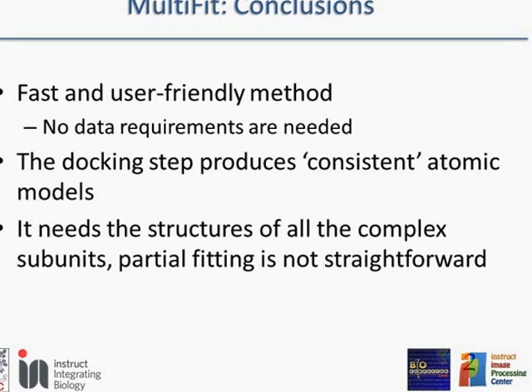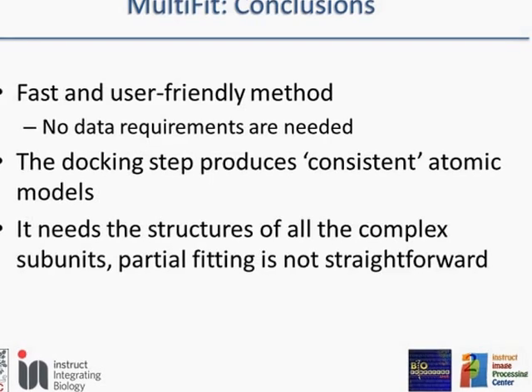Because it is using a docking step, MultiFit produces quite consistent modes, consistent from the docking point of view. Of course, the biggest limitation of MultiFit is that we need all the structures of my complex. If one structure is missing, then we are not going to be able to use it straightforwardly. What we would have to do is find where the missing structure should be in my map and delete this region of my map.